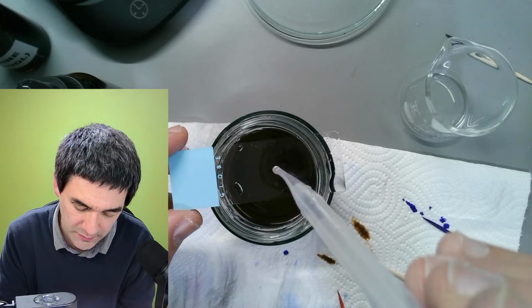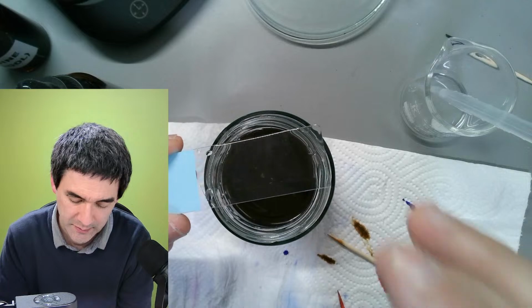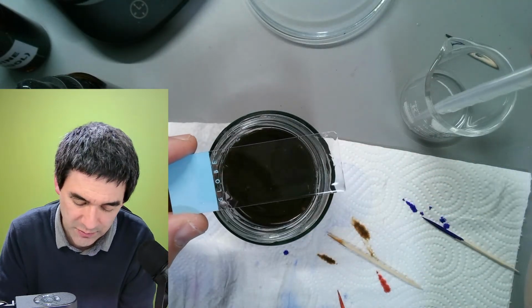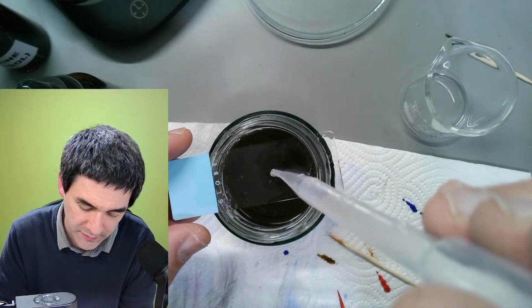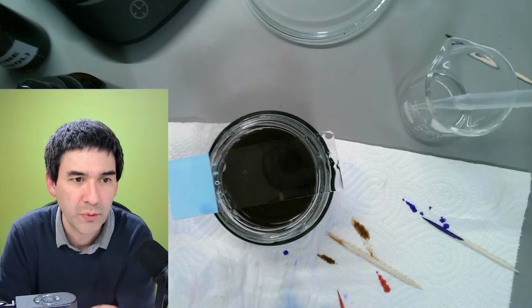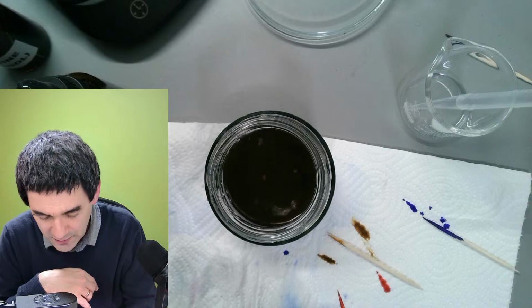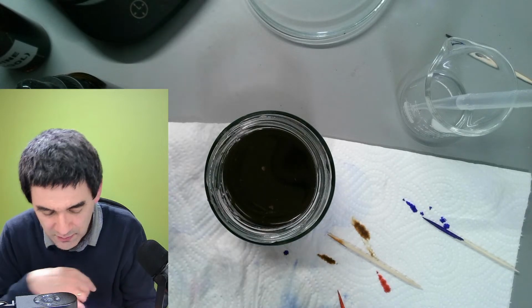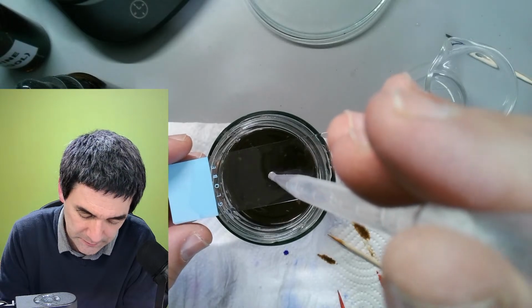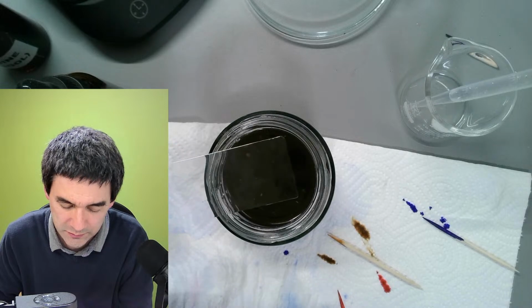Let's see how well this works. I'm going to give it maybe a minute, but there's nothing coming out anymore. Okay, nothing coming out anymore.